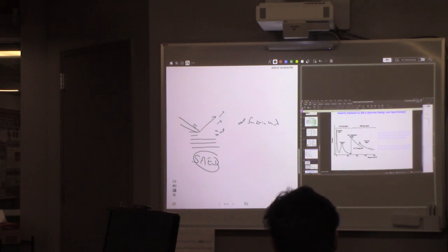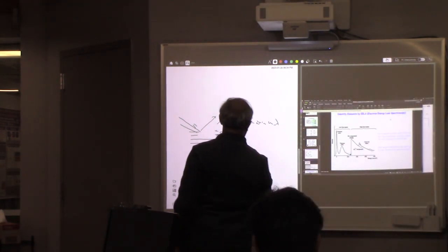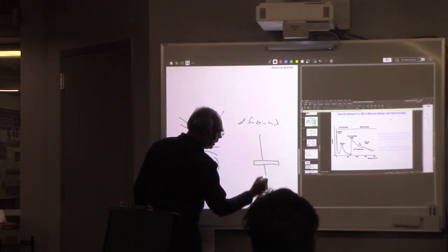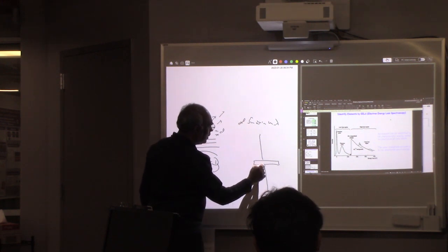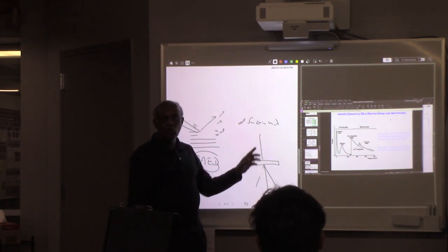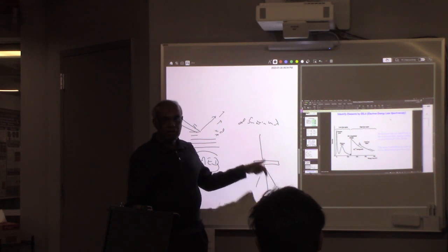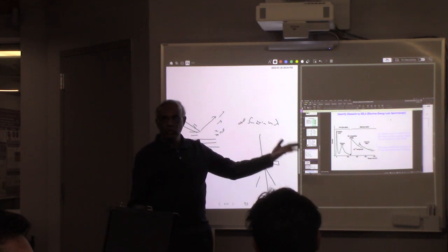So then the next thing is this thing called EELS, electron energy loss spectroscopy, that basically you do in the TEM. Remember I told you, when you have this specimen here, the electron beam, some electrons go directly through and some are elastically scattered, some maybe inelastically. If it is elastically scattered, you don't see any change, right? Because energy is not lost. But if it is inelastically scattered, you lose energy, right? So where do you lose this energy to?